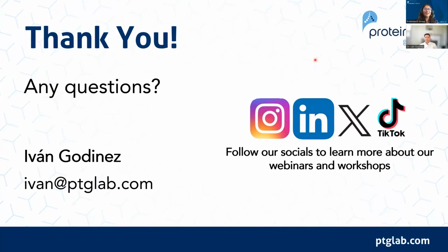All right, great. There is a question about the TCF7 and IL data that you showed. They were curious if there were any other validation steps taken to ensure that they weren't artifacts, mainly because high RNA but low protein seems to make sense, but low RNA and high protein is less obvious. Do you have any ideas on that?